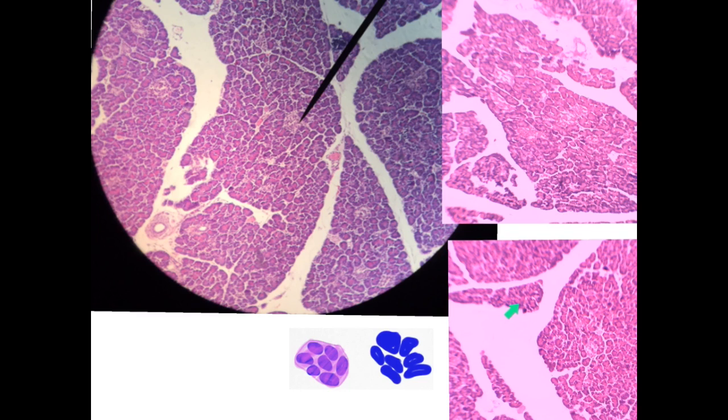Also in this picture, here you will see the lobules formed of the acini, and this is the islet of Langerhans. No intralobular ducts. Also the lobules, no intralobular ducts, but only islets of Langerhans, but not necessary to find islets in your section. The most important thing is the absence of the intralobular ducts.